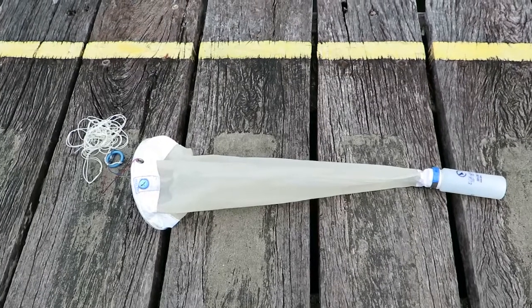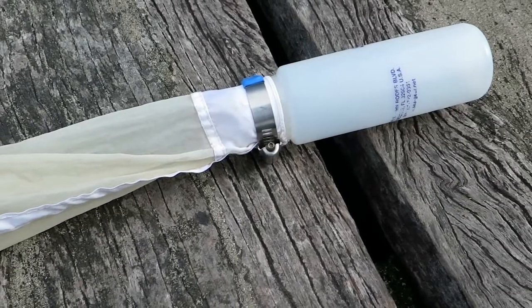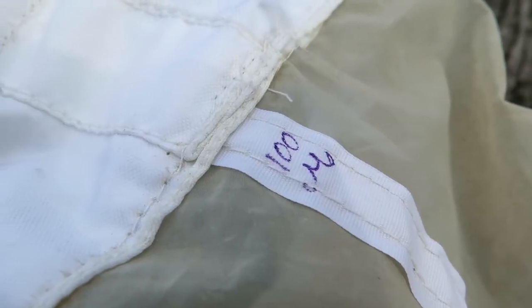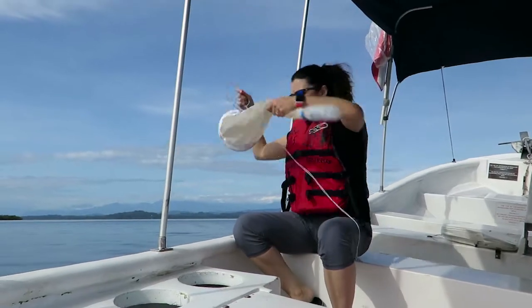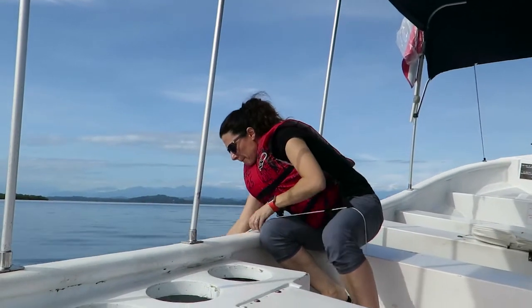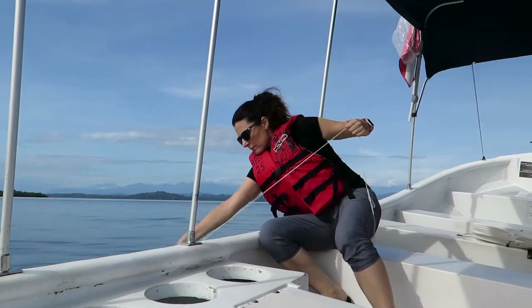For collecting the medusa you will need a plankton net with an end jar and a mesh opening of about 100 microns, and a few wide-mouth sample jars. Medusa of the class Hydrozoa are extremely abundant but very small, inconspicuous, and understudied.